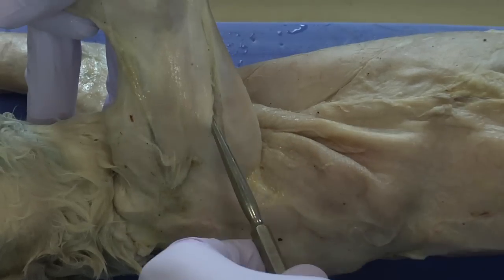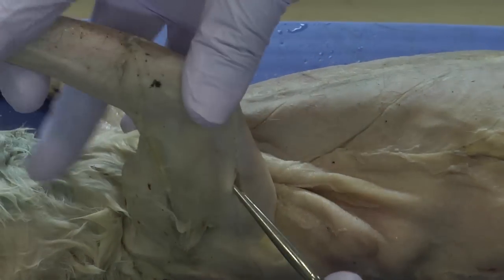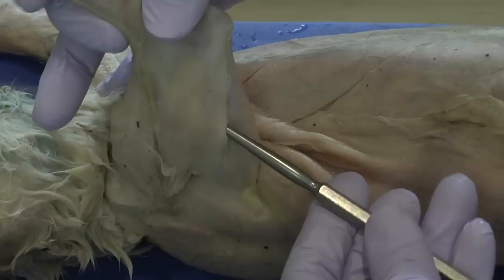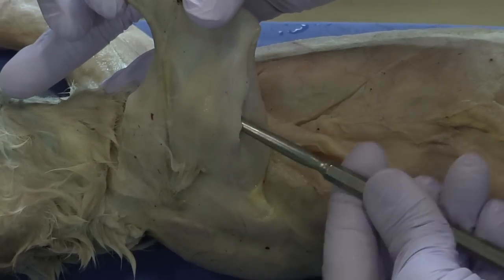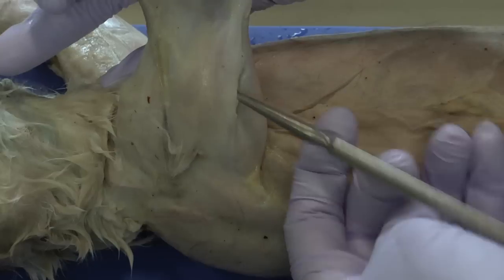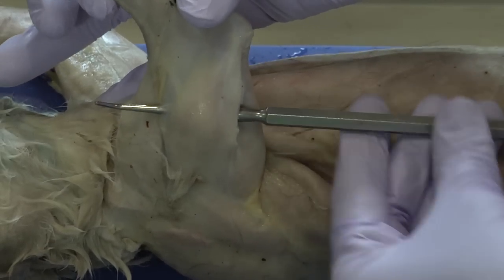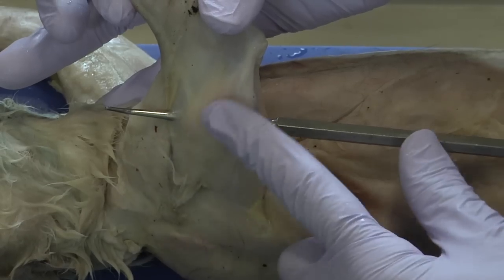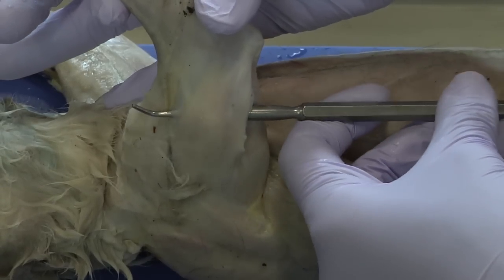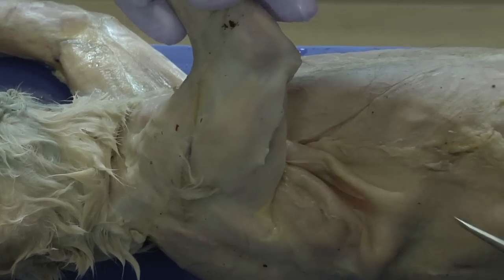I've been able to find the access point in between the triceps and the muscle that lays over top, which we're going to need to get around. You can see how the probe has gone through to the other side, and that lets me know where the boundary is between this muscle and the muscle that we're trying to bisect. I'll use that hole as my marker.